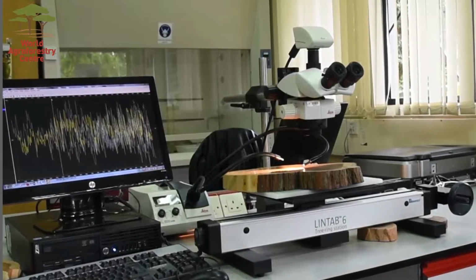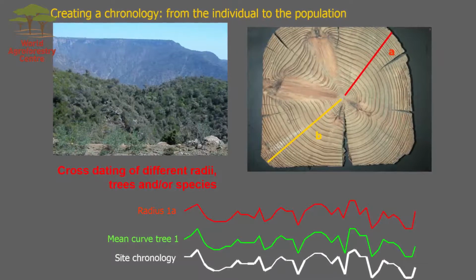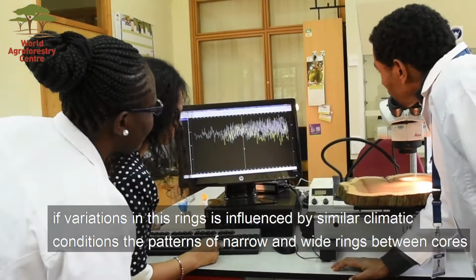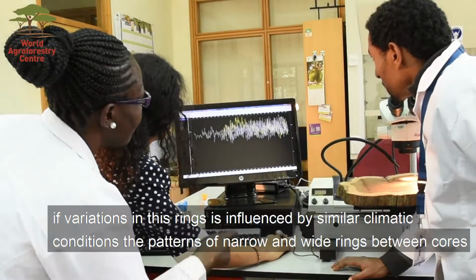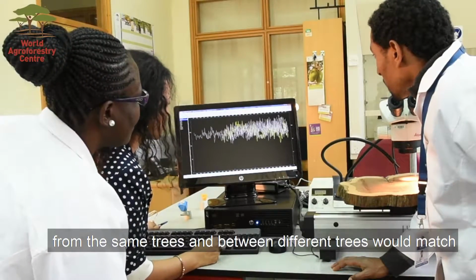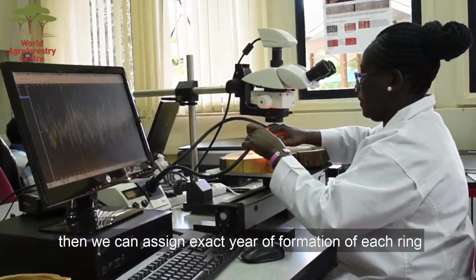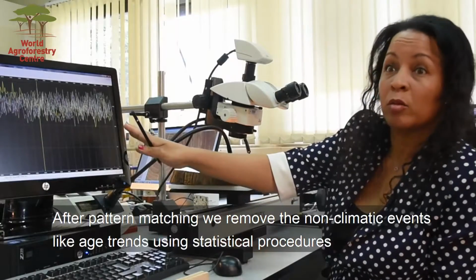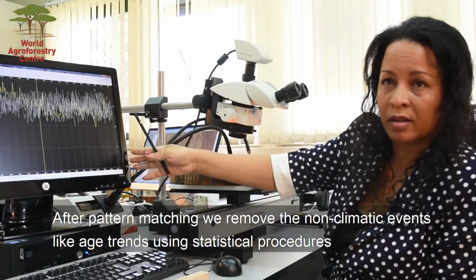After measurement, we do cross-dating. That means synchronizing the pattern of narrow and wide rings. This is a very important part in dendrochronology. If variation in the rings is influenced by similar climatic conditions, the patterns of narrow and wide rings between cores from the same trees and between different trees would match. Then we can assign the exact year of formation of each ring. After pattern matching, we remove the non-climatic events like age trend using statistical procedures.